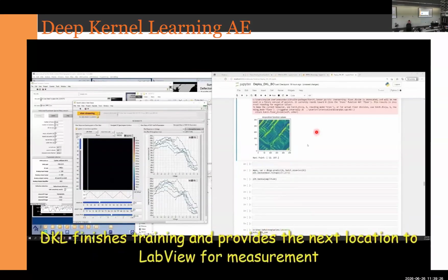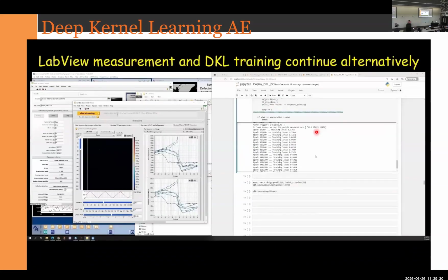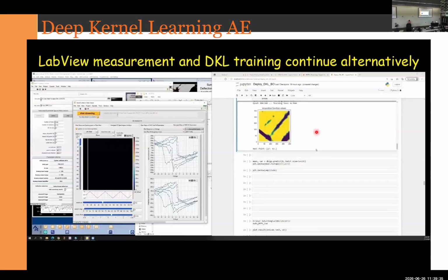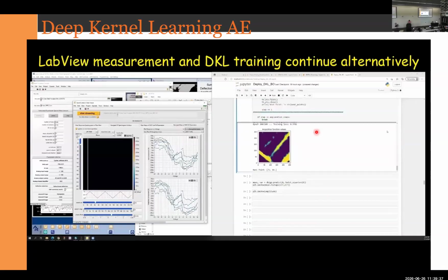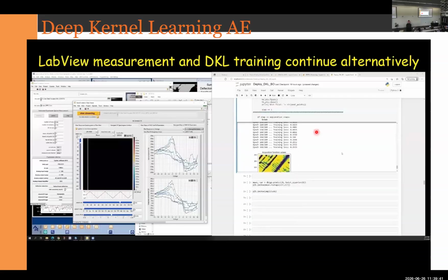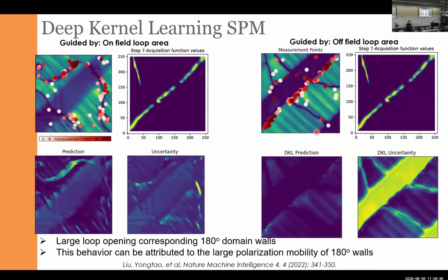And we did this type of experiment for a long, long time. First at Oak Ridge, then once I moved to UT, in the first half a year, we set up the deep kernel learning setup on the SPM. So it kind of works as well. And the problem was always the same: once we run the experiment, if the experimental framework is simple, then algorithms work well.